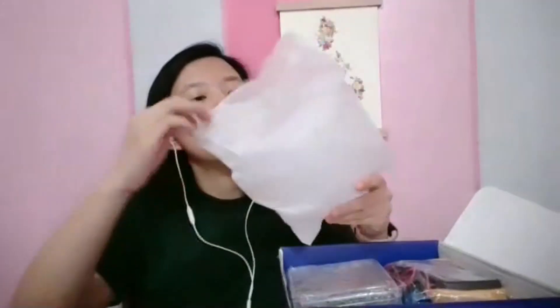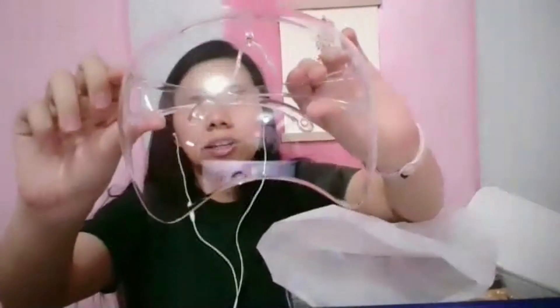Next in the protective equipment, they are providing everyone with face shields. This is a pretty curved kind of face shield — I actually appreciate this a lot. You can put it on top of glasses as well if you're wearing glasses. You can also use this beyond lab for when you want to go out for errands. It's pretty sturdy with a thick plastic material. This is provided in lieu of lab goggles, and it's more multipurpose — you get full face protection as well as predominantly eye protection.